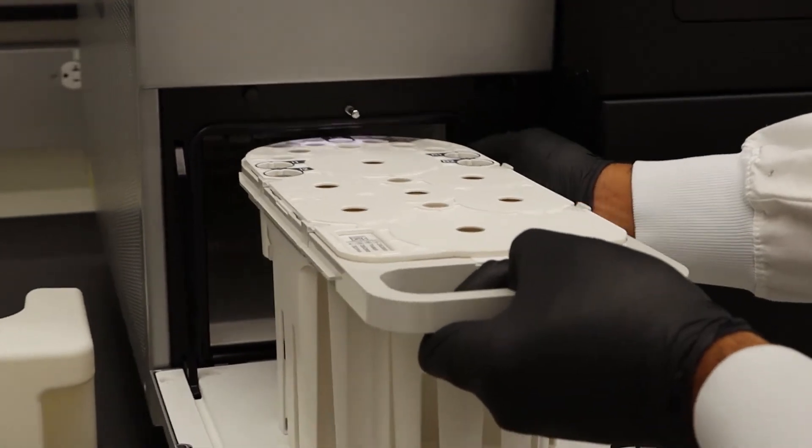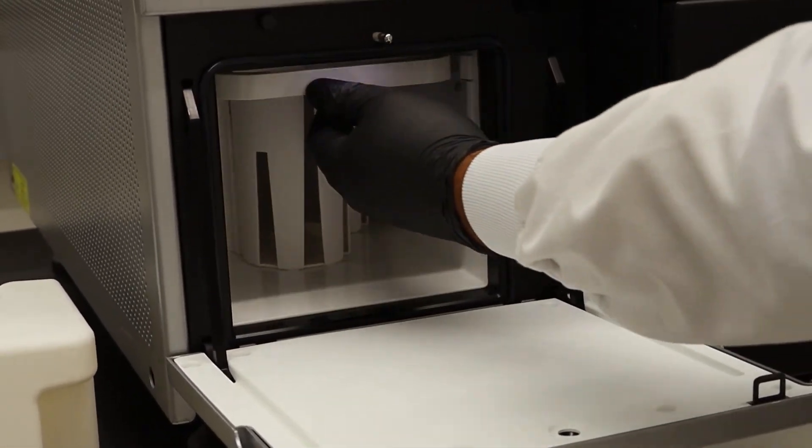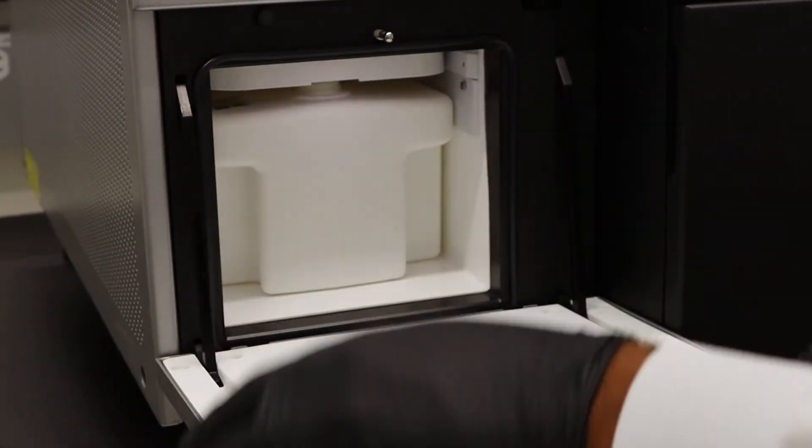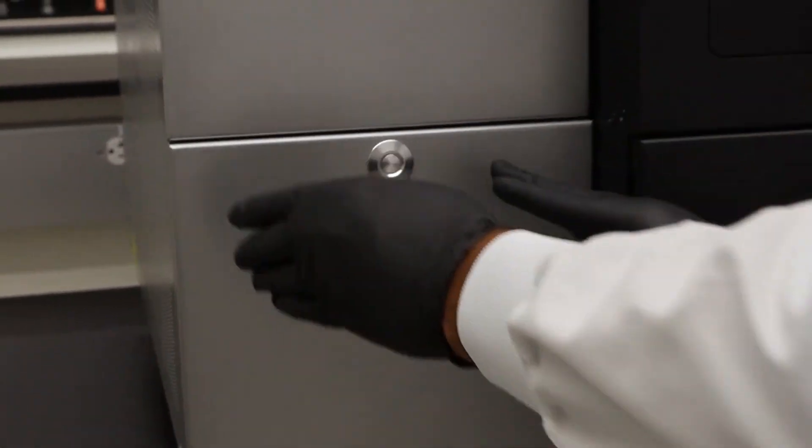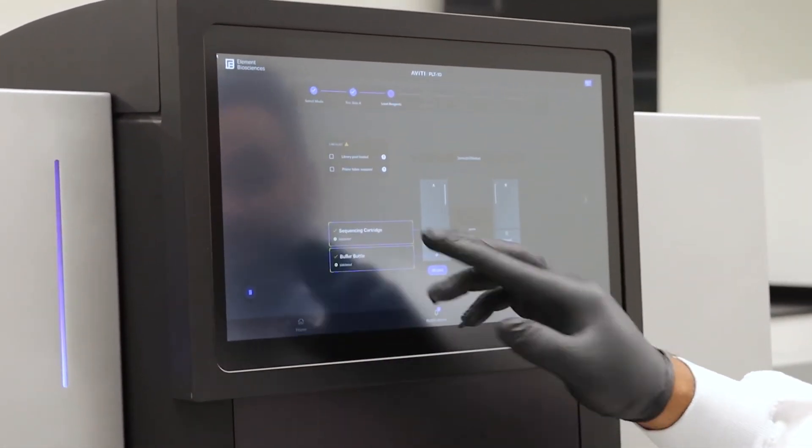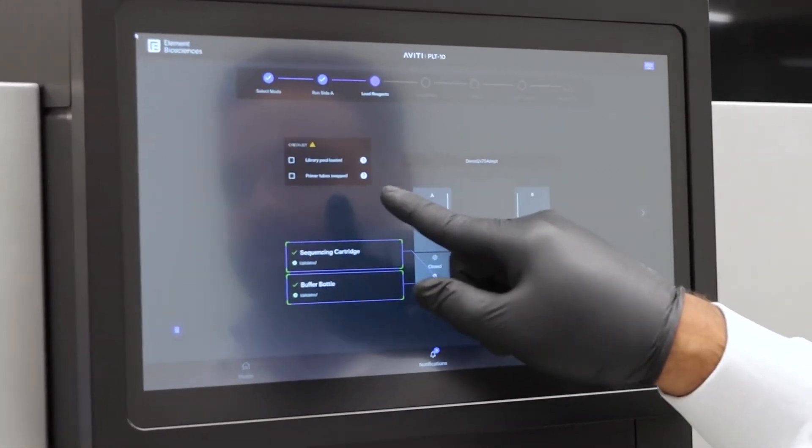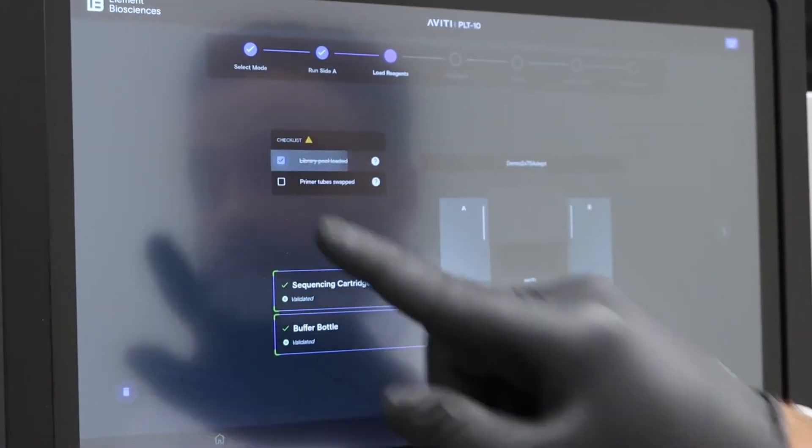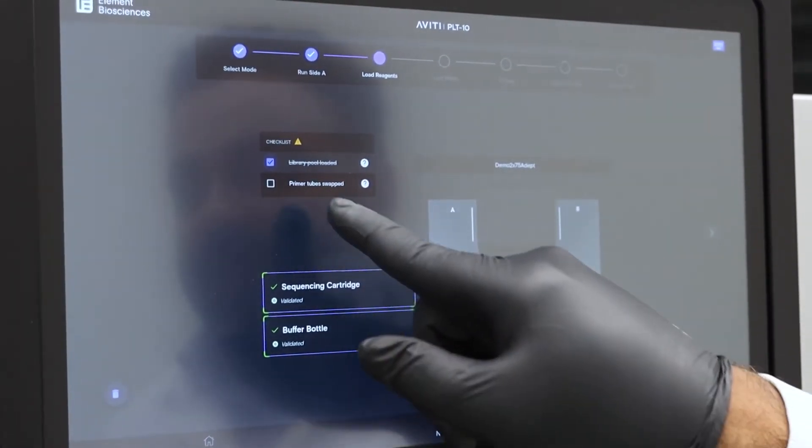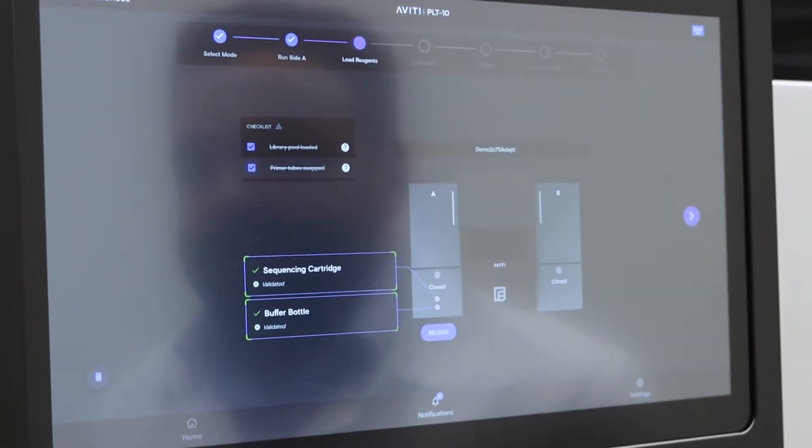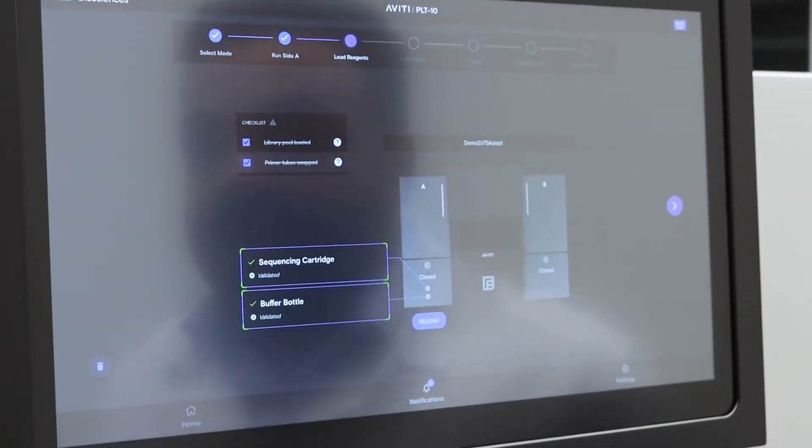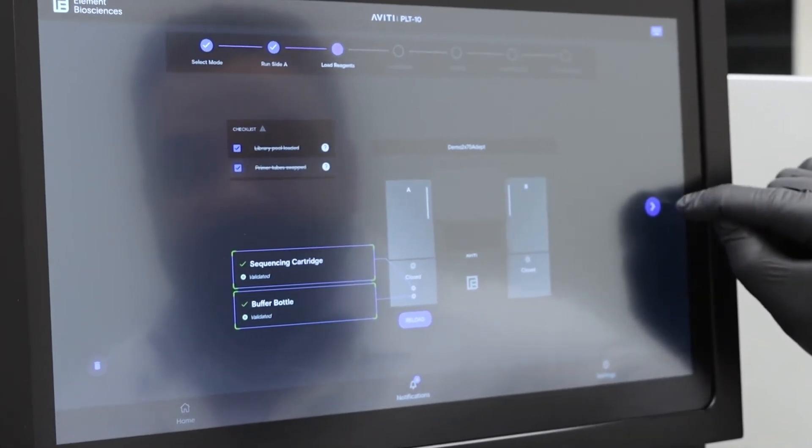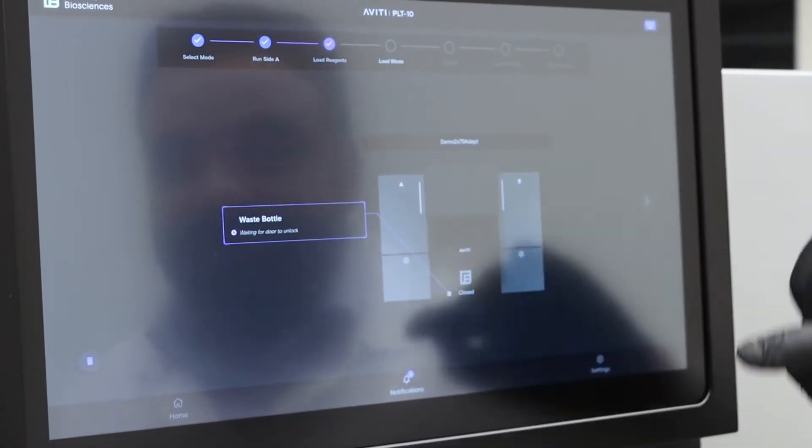Once you insert the reagent cartridge back into the instrument and the universal wash buffer, you then close the door. You will see the software confirms that you've completed the step with the green check mark. Once you've gotten the green check mark, please also confirm with your checklist that you've loaded your library into the reagent cartridge and that the correct primer tubes are in the reagent cartridge to make sure that you have the right elevate or adept workflow. Once you complete that, then press next.